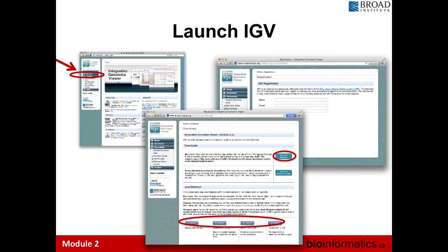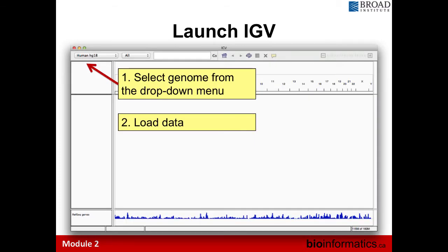Once you launch IGV, you'll see the initial window. First and foremost, always select the right genome. If you're working on GRCh38 but have the wrong reference genome loaded, the second you load any data, all your reads will be colored as a rainbow — the positions don't align and you get SNVs called all over the place. It looks visually appealing but tells you nothing useful. Once you have the right genome specified, you load your data — from a local file, a URL, or a server.